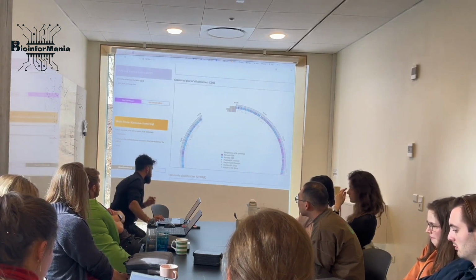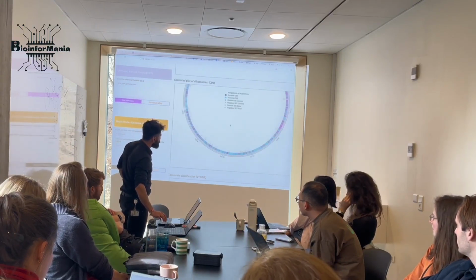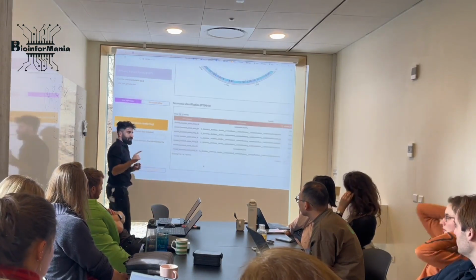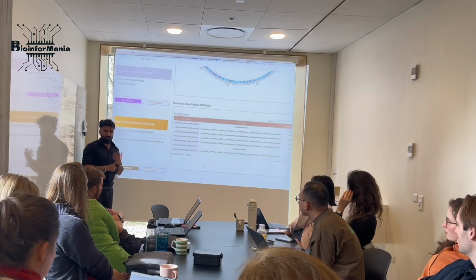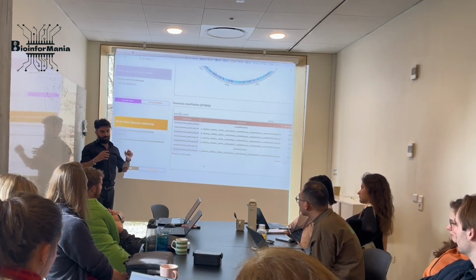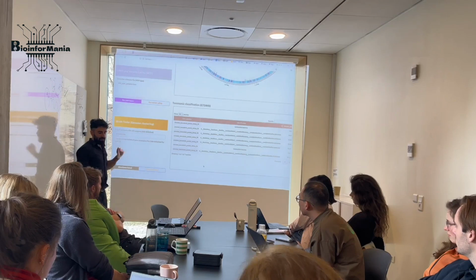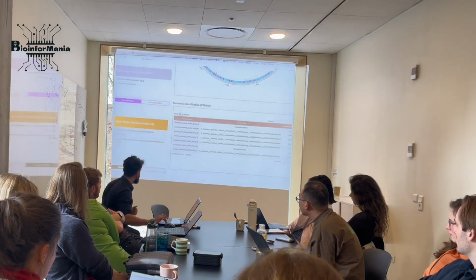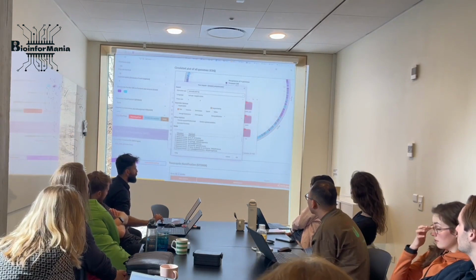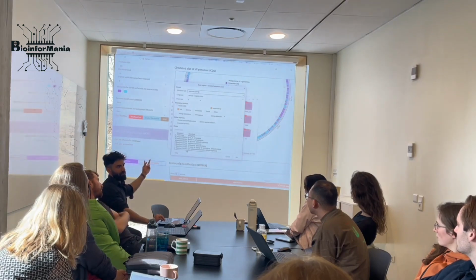So in some scenarios, you want to cluster these genomes together or do some classification of genomes based on presence, absence, prevalence, or abundance of a certain gene set. That gene set, we call it an enzyme. So the enzyme table should look like this. There are two columns, one column called function, one column called enzyme. So there are several enzymes that do the same function, right? So you need to know these two roles.